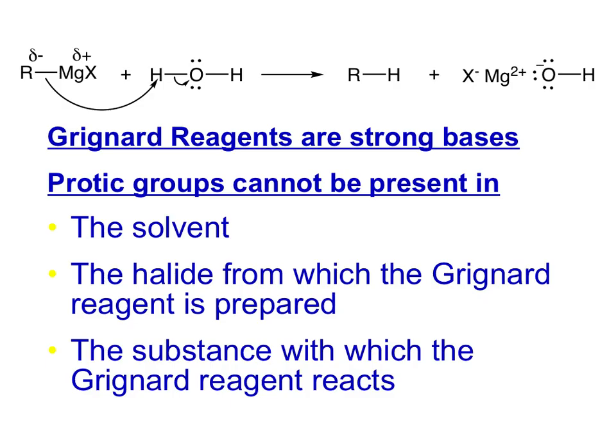The primary protic molecule that we're concerned about with a Grignard reagent is water, right?